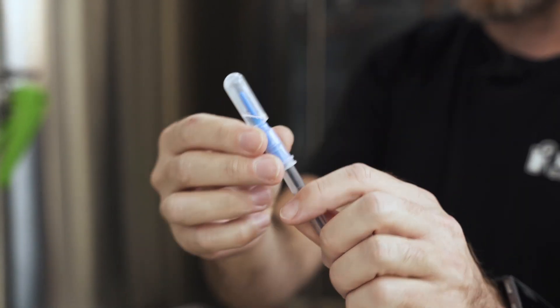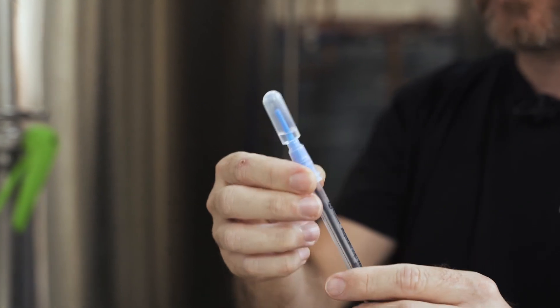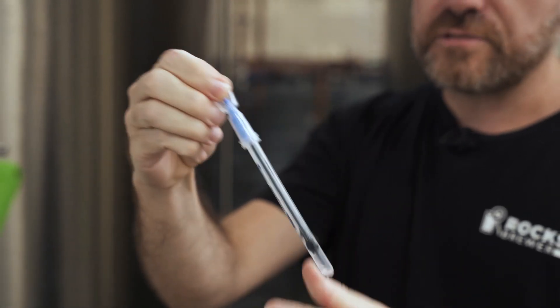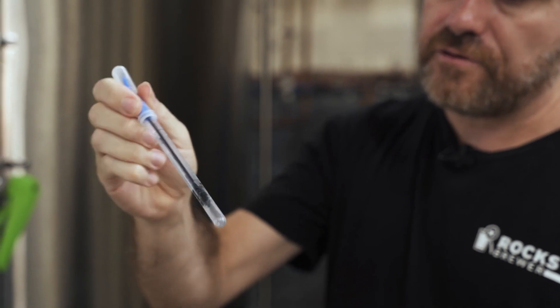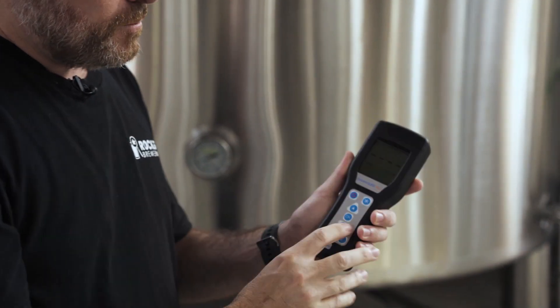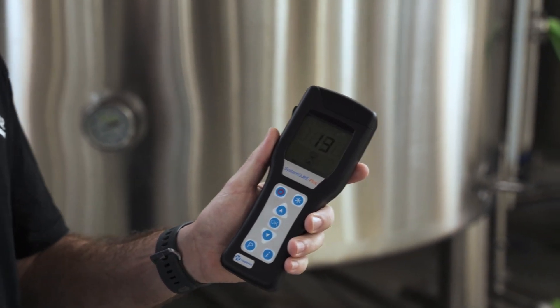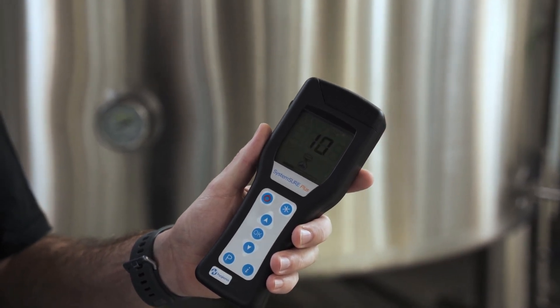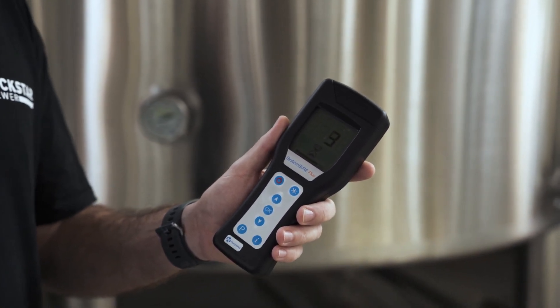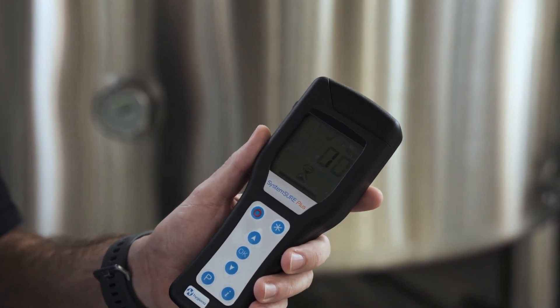Now, you can see there's the luciferase enzyme at the top of the ATP stick. All I do is snap the stick at the top, squeeze the enzyme down into the sample at the bottom, give it a bit of a shake, and give it a minute or so. Then we're ready to put it in the ATP meter. I pop the stick in, press the OK button — it gives a 15-second countdown — and then at the end it'll give us our RLU number and tell us how clean the cold liquor tank is.